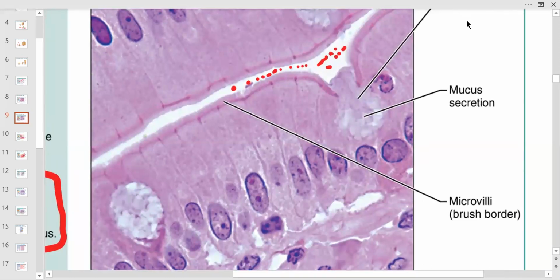But do you notice the nucleus, let's look binuclear, this one. One nucleus per cell. This is the plasma membrane. All this is the cytoplasm. Yeah? So this is the digestive tract.